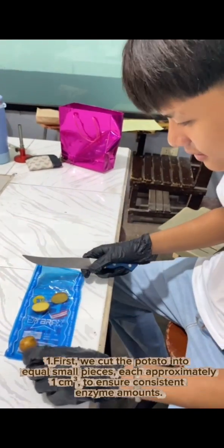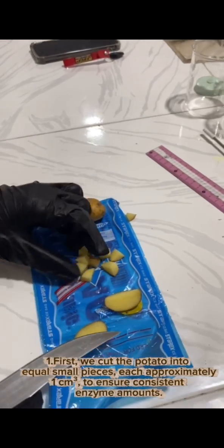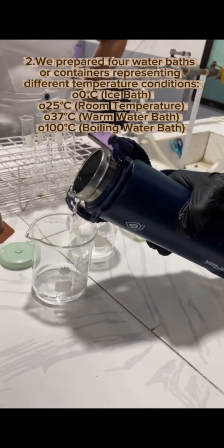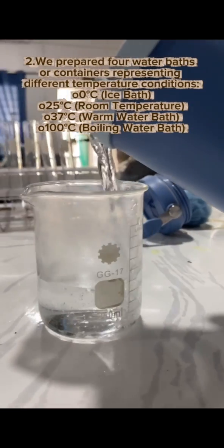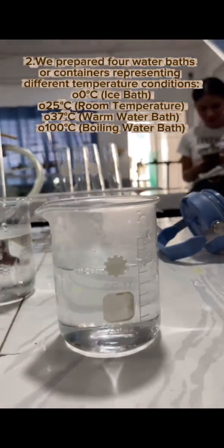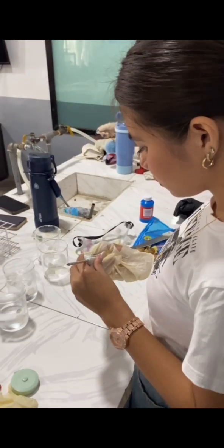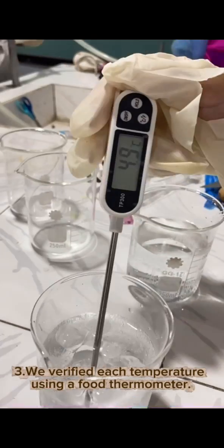First, we cut the potato into equal small pieces, each approximately 1 cm cube, to ensure consistent enzyme amounts. We prepared 4 baths or containers representing different temperature conditions: 0 degrees Celsius ice bath, 25 degrees Celsius room temperature, 37 degrees Celsius warm water bath, and 100 degrees Celsius boiling water bath. We verified each temperature using a food thermometer.